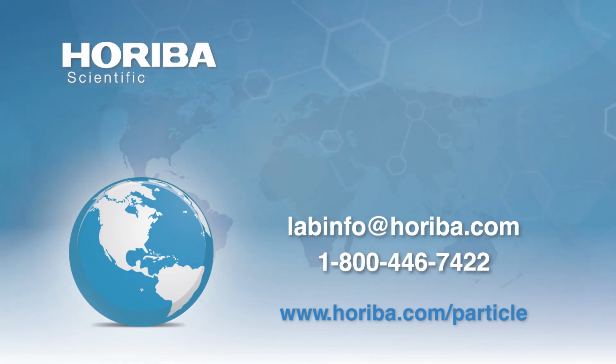Anything that you can comment on microplastic specifically? Yeah, so I guess one is, if you're analyzing microplastics, it's like analyzing anything else. Actually, the polystyrene latex are effectively microplastics. I mean, they're tiny little plastic spheres. There is a huge interest in microplastics as contaminants of the environment, which would be questions we kind of get at after the verification of the system.